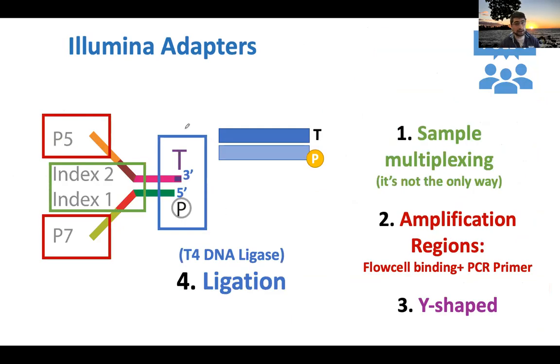So the final very important information that is carried on the Illumina adapters, and it's actually the one that we are mostly interested in at this step of the library preparation, is the end of these adapters. Okay, so this is depicted in the blue box.